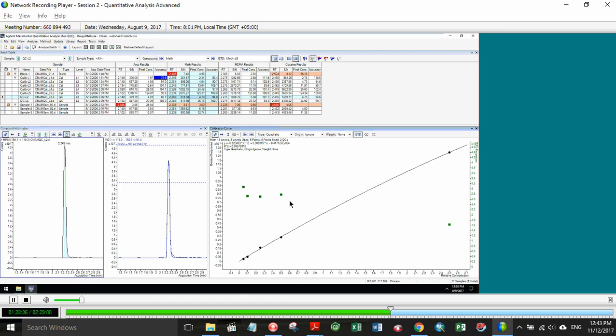Clinical has some certain criteria that they need to use, whereas EPA methodology, a quality control operation locally would probably have their own criteria to utilize. So I can't really answer that one because it depends upon the regulatory agency and what their criteria is. In the MassHunter software, we're giving you lots and lots of options. And being that this is a global webinar, it really can range.